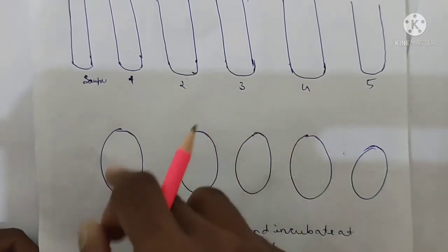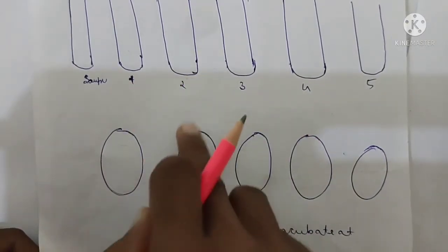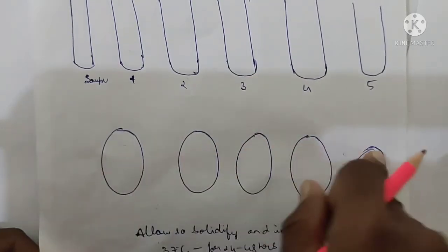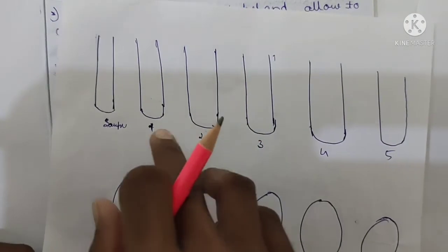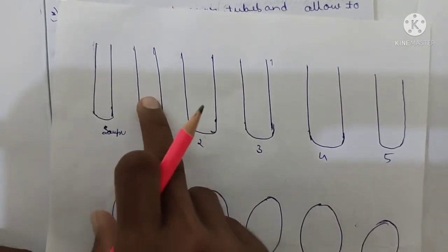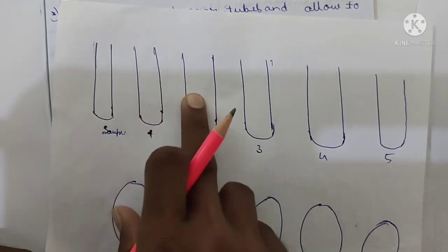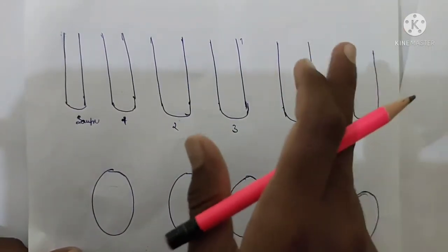We have to pass that all. From here 1 ml to this, 1 ml to this, 1 ml to this, respective to all the 5 petri dishes we have to transfer. Okay, understand, you will get confused about one thing here. I have told you to pour from 1 to 2, 2 to 3, 3 to 4, 4 to 5. Okay, after that what do I have to do?